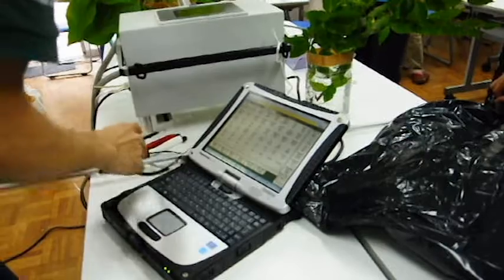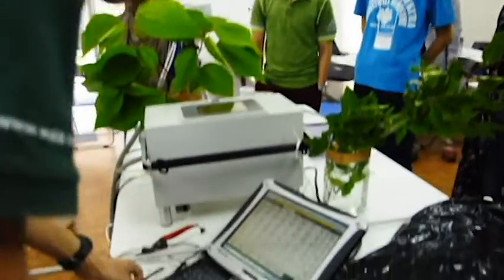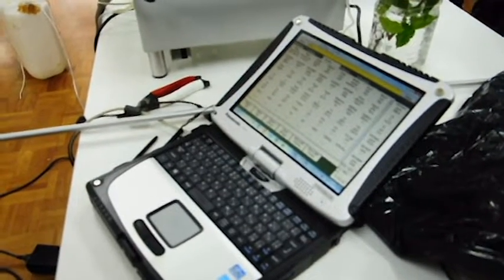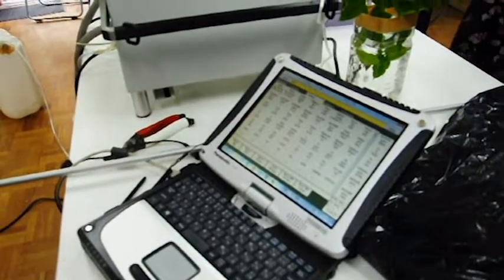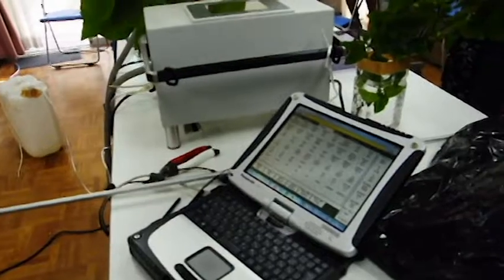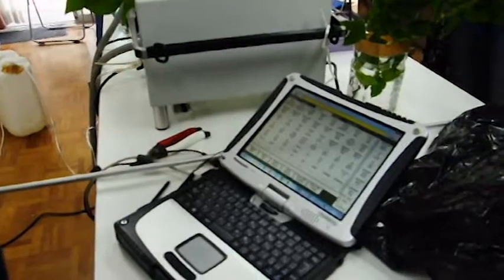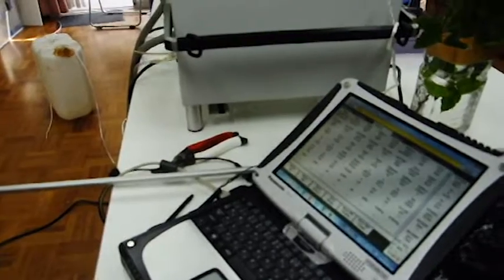Okay, before the lecture, I recorded the values. So, Hanawa-san, could you write them down? Yes. The photosynthesis is 13.77. And the conductance is 615. And the transpiration is 6.79. And the Ci is 331. Yes. Okay.